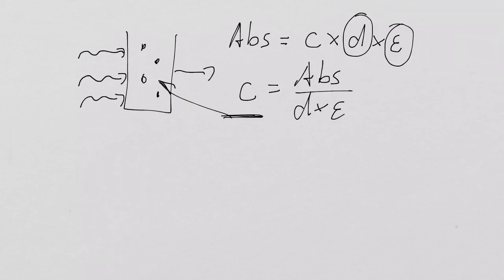So I don't have to go along and count molecules. How much is there in this solution? I just simply measure the absorbance at a defined wavelength. This wavelength is incorporated in the extinction coefficient. And if I get an absorbance, presto, I get my concentration. Simples.